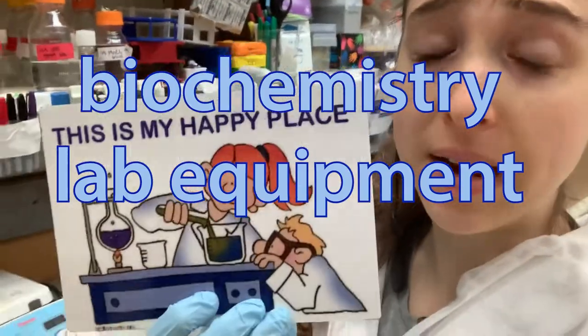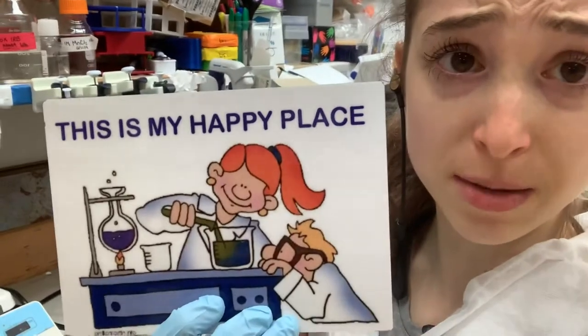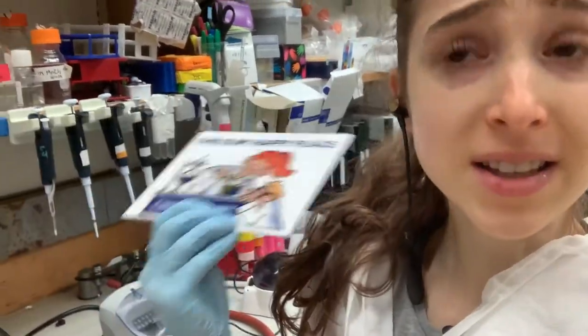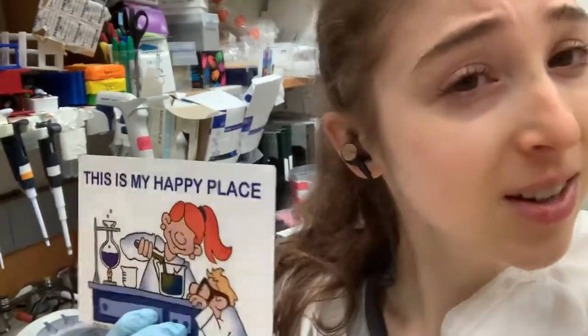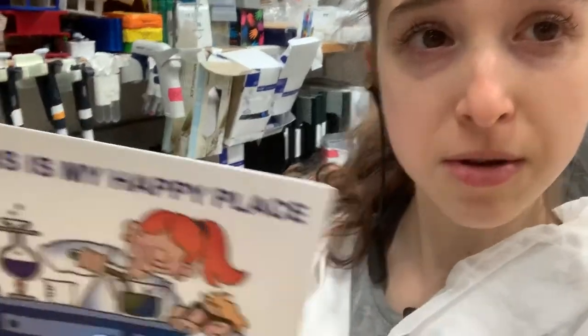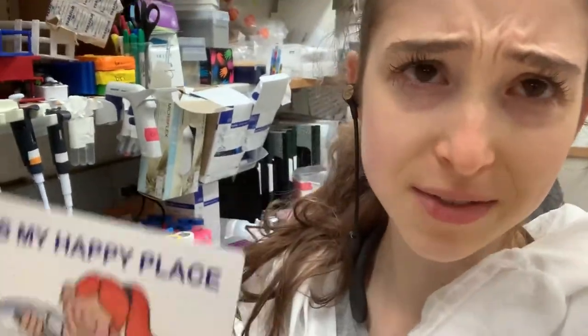My thumbs really miss pipetting. Yesterday my lab mate was washing bottles and I got jealous. I've been working on my thesis and preparing for my dissertation and I really miss actual wet work at the bench experimenting. I'm feeling very nostalgic about lab equipment so I thought I'd revisit this video that I made a couple months ago and added some more stuff to the end of things I forgot to tell you about.